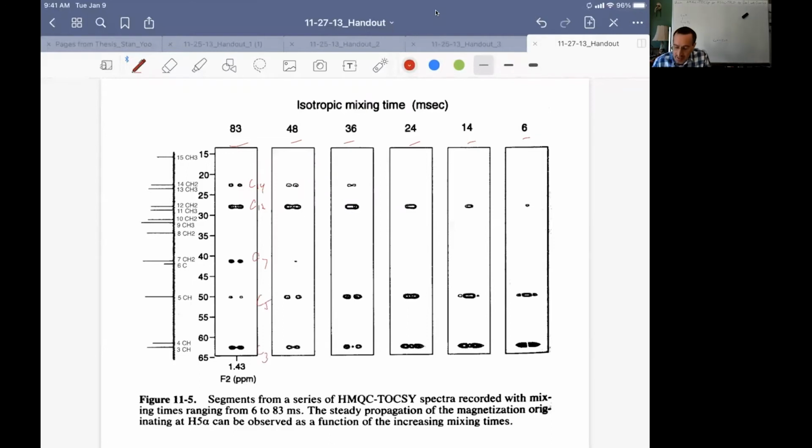So coming back to the question of how this differs from an HMBC, these are all carbons that have protons that are J-coupled to each other. This is an entire spin system that's going to come up. So we already elucidated one spin system, the C4 to C10 to C8. And we started on this next one with C3 and C5.